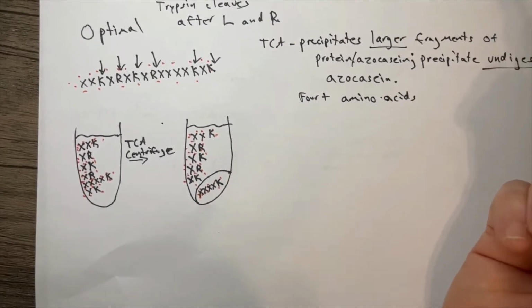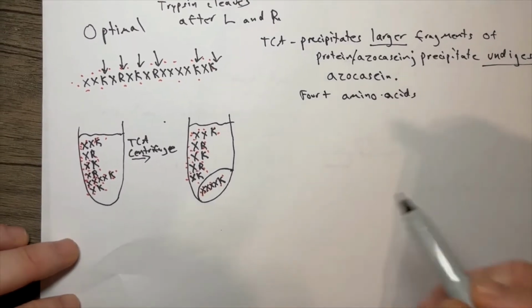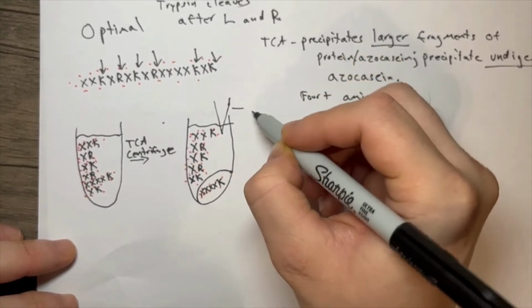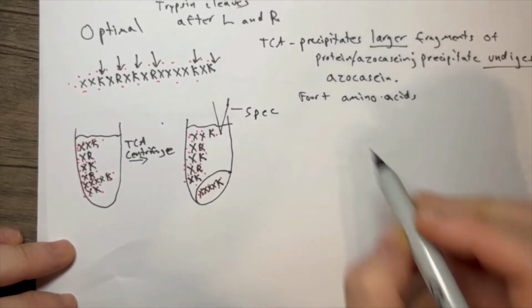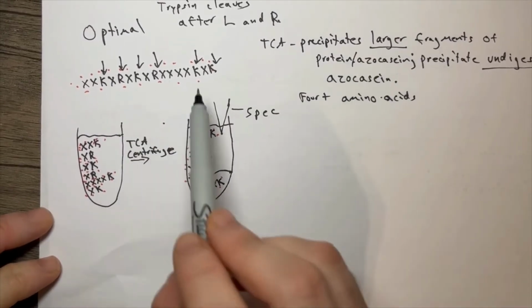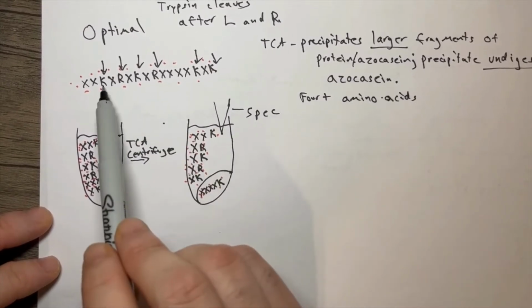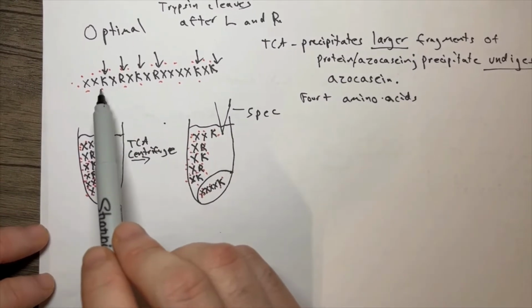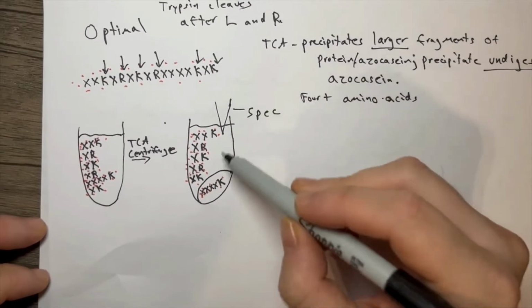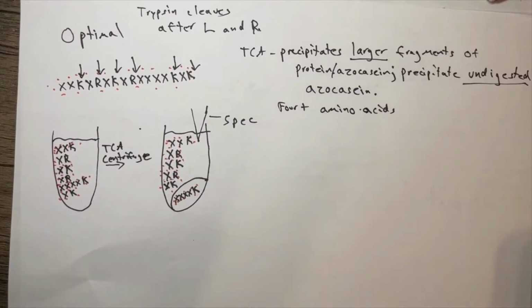And that'll result in the supernatant being an orangish color, right? And that's what we take with the pipette, run on the spectrophotometer, and grab the absorbance reading. Remember, this is optimal conditions, right? Trypsin can do its job most efficiently. It can cleave after every single lysine and arginine. Then we'll take that supernatant, run it on the spectrophotometer, and get that absorbance reading.